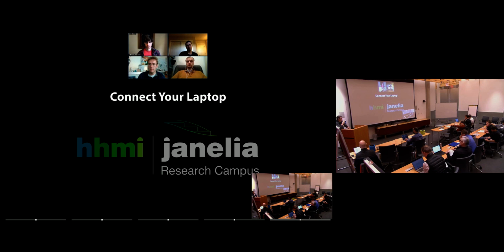That said, the reason we come back to Micromanager as often as we do is because it's kind of this devil we know problem. We know we can get something up and running. We know we can get a new instrument up and going, especially with the driver support that's there. But then the challenge is this upper level integration that Brian hinted at, where Micromanager is integrated into another product that maybe is controlling the acquisition, but you also have this other communication with things in the building and other systems that you need to control.